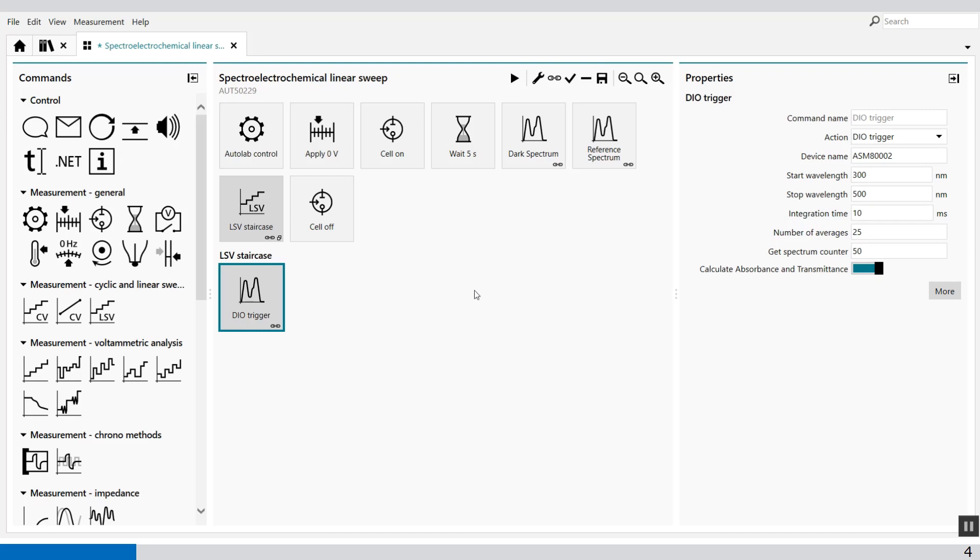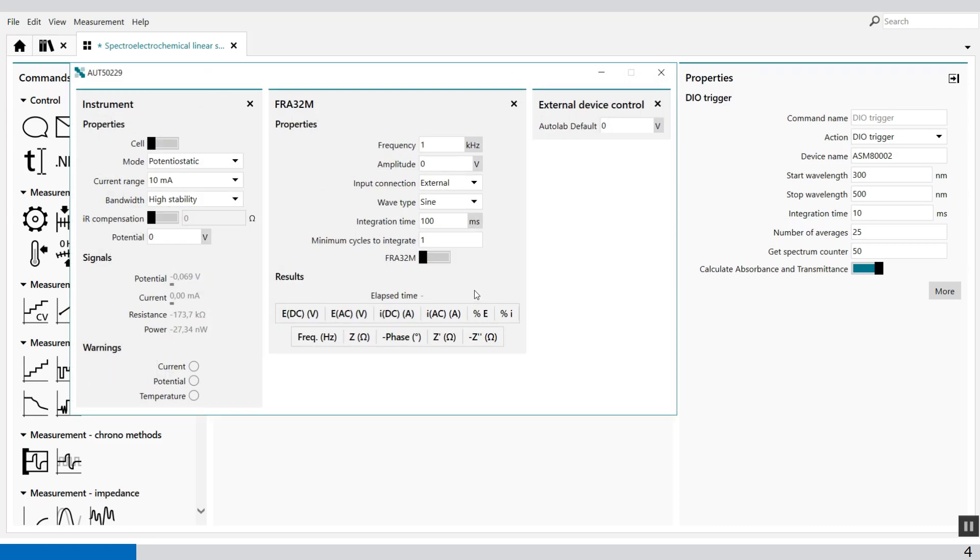The working electrode, counter electrode, and reference electrode is connected. We only have to check the open circuit potential by pressing function 10 button. And let's see what kind of potential we have if it's stable. Well, it's pretty stable. Minus 0.067 volts. So we can start the experiment.